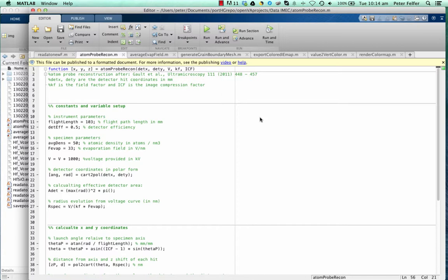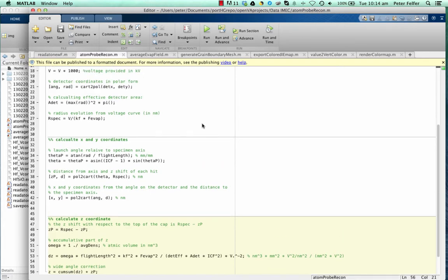And atom probe reconstruction is actually very, very simple, and I'd like to show you that, and maybe you won't be as shy anymore and work with your own reconstructions and try to come up with something new, because we need new solutions for atom probe reconstructions these days. Anyway, the entire reconstruction protocol, and this is a little bit of a simplified version, but you can easily alter it to fit your needs, is this code here.